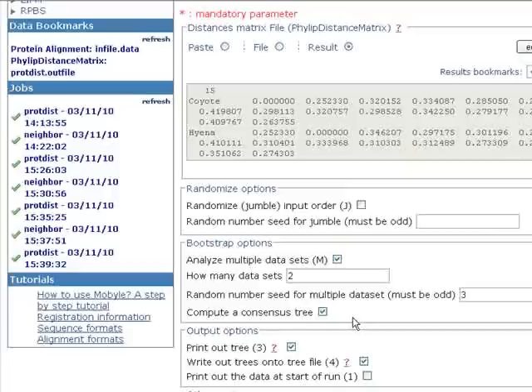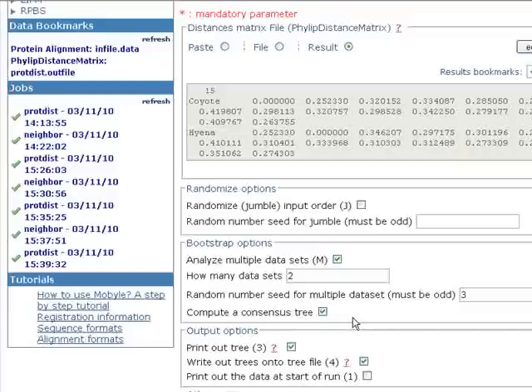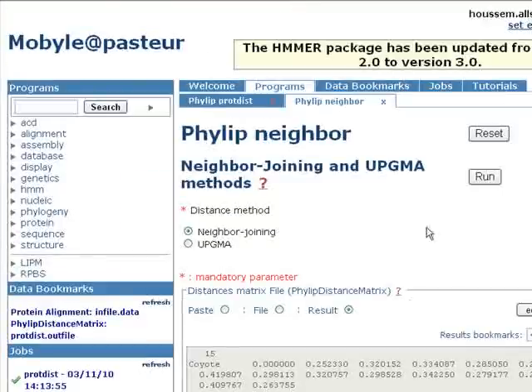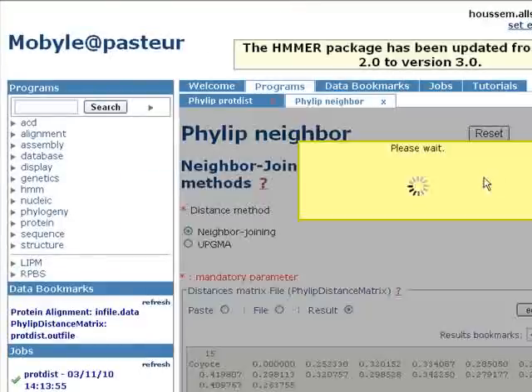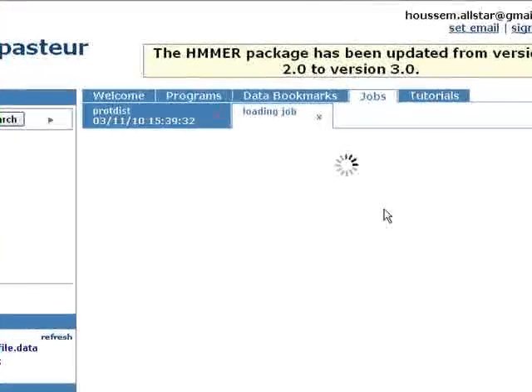This option tells neighbor to return the tree that has the best agreement with the replicate data sets you provided. So we click on run and wait for the result page to queue.